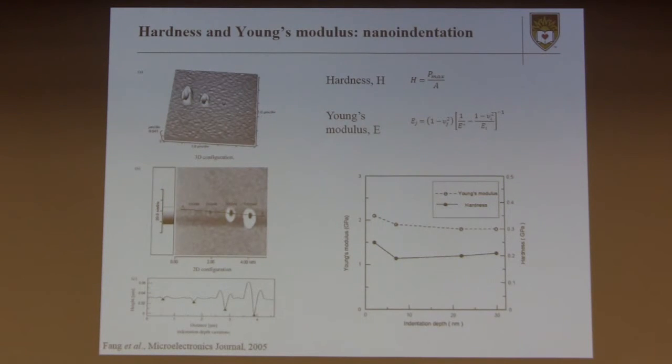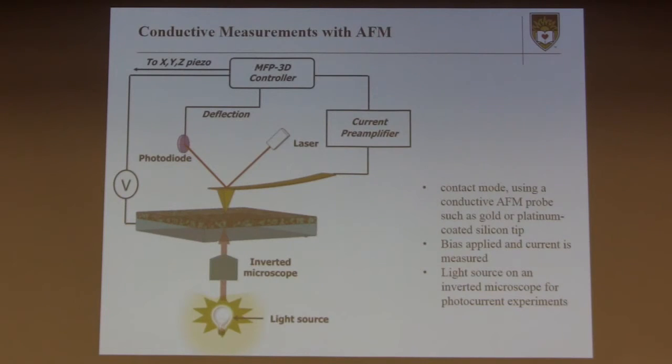You can probe hardness. If you push it into the sample, you'll probably indent it, and from there you can get hardness, which is just force over area. Or you have a small jet. Jonas? Yes?